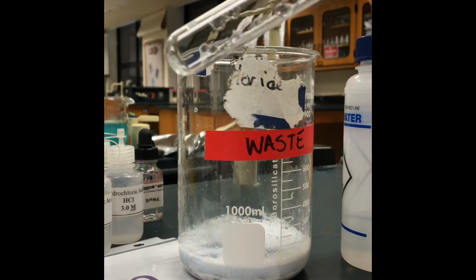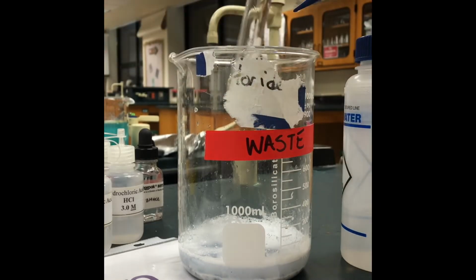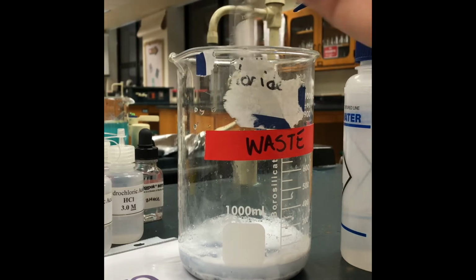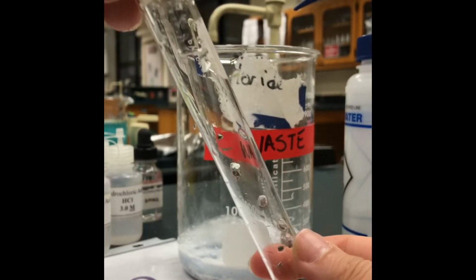Now I'm gonna show you. So there's just a few little particles left. I'll try to put that down. Again, careful with the clanking. Again, maybe a spatula would be really good at this point. Okay, but at this point, hey, that's so little. It's okay if that little bit goes down the drain.